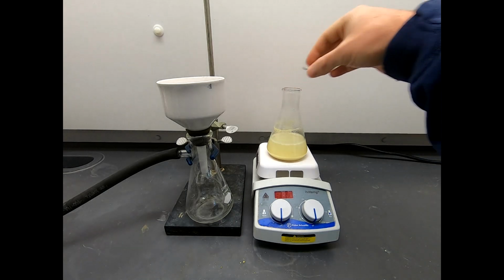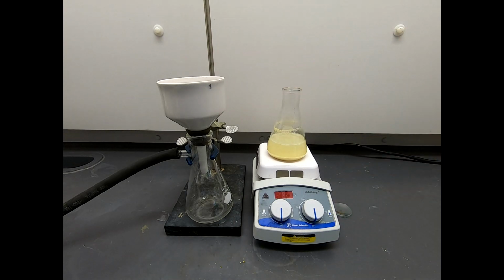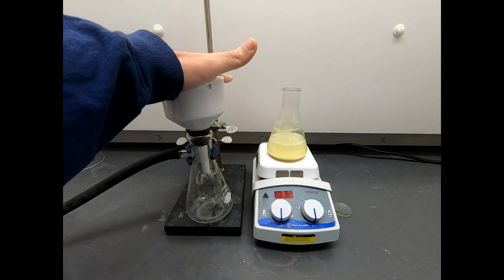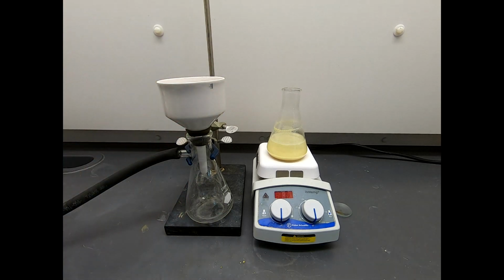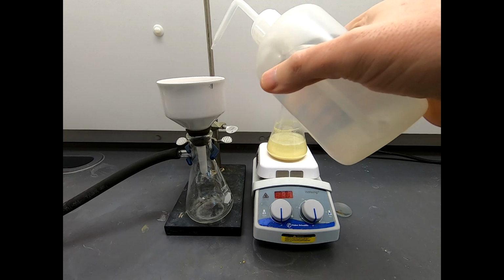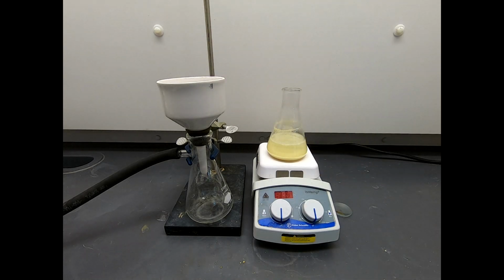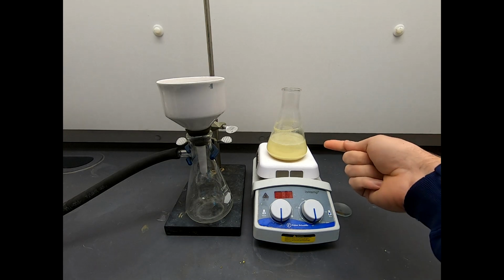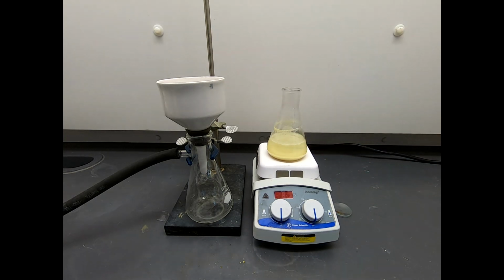So let's go ahead and filter this. I already have a 250 milliliter sidearm flask over here. We have a Buchner funnel and a filter paper in there. And let's spray a little water. I'm using water to seat the filter paper. This is not water. It's that 1% acid solution, but that's essentially water. So I'll use it to seat the filter paper.